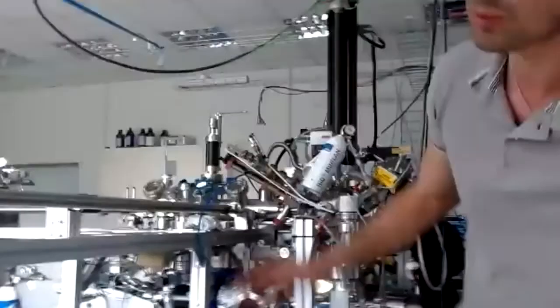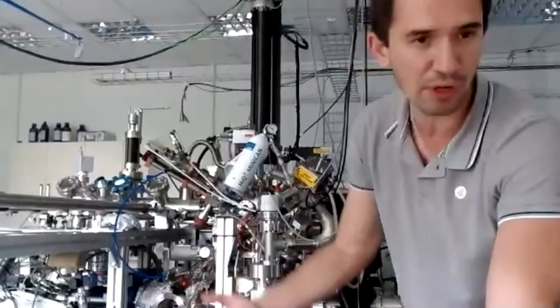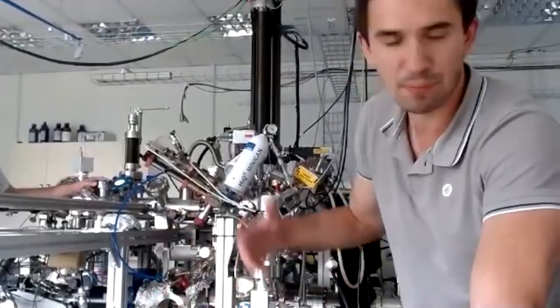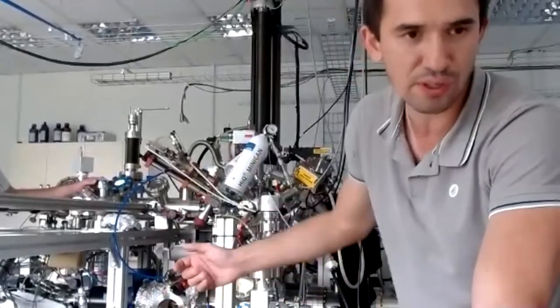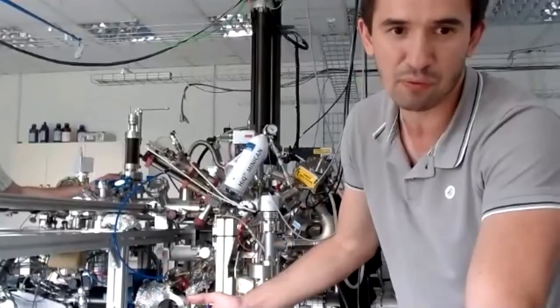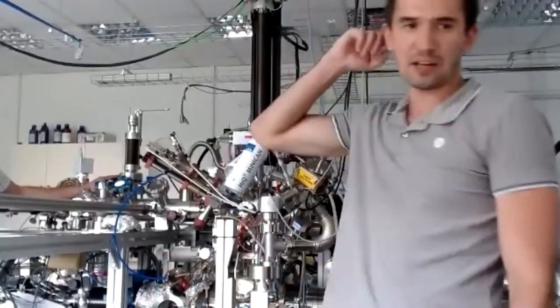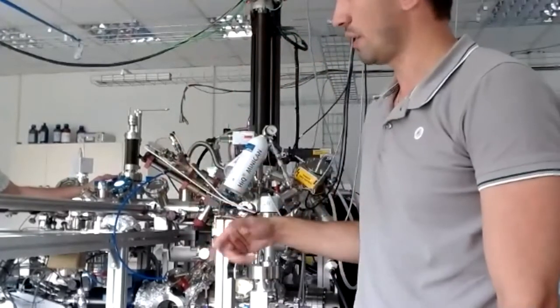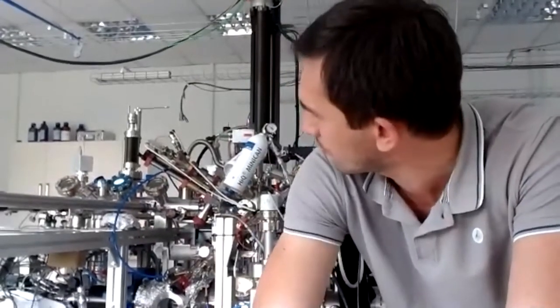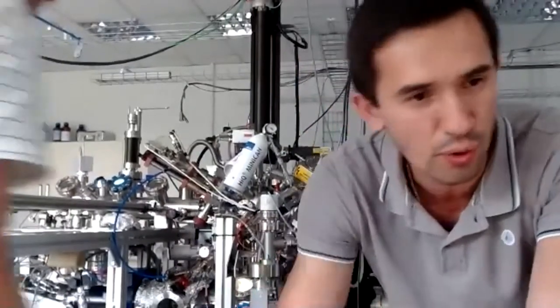Yeah, first to the preparation chamber. In that preparation chamber, you can change your sample. It means you can sputter it and clean it. So this single crystal of palladium was sputtered and annealed before. Now it is in the analysis chamber, and we would like to move it to the NAP cell now. It is clear, I guess. Maybe we can switch to the second computer, and we can show you how all these manipulations are done. So for this, I will stop.